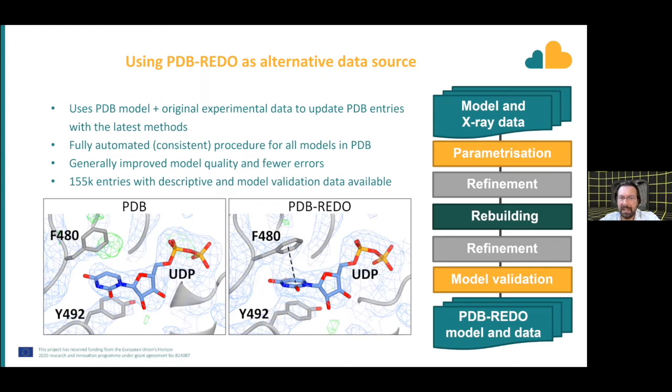Now you can see that with this new conformation of this phenylalanine, the UDP base is stacked between two aromatic residues. So if you're doing a study on ligand binding, this is a much more useful data set.